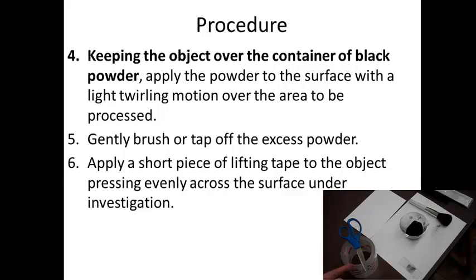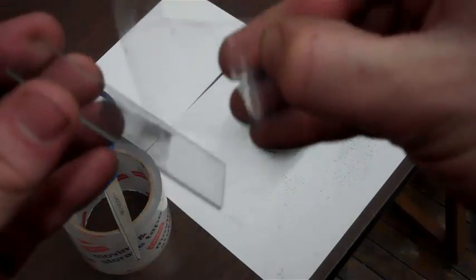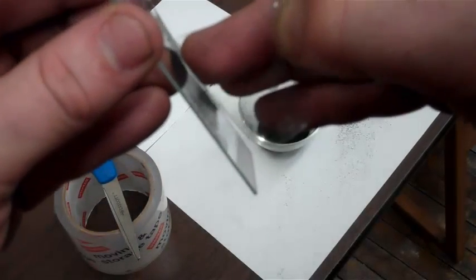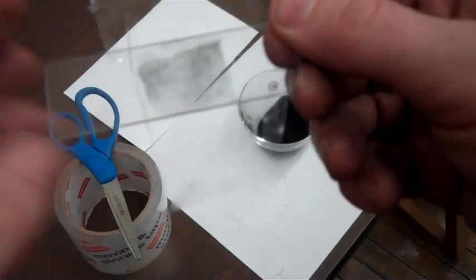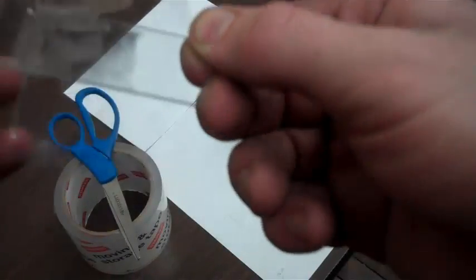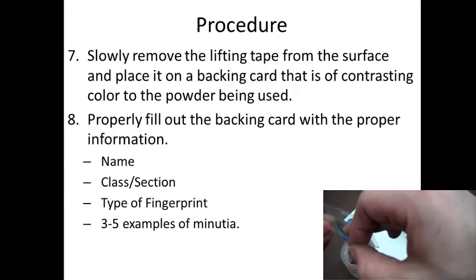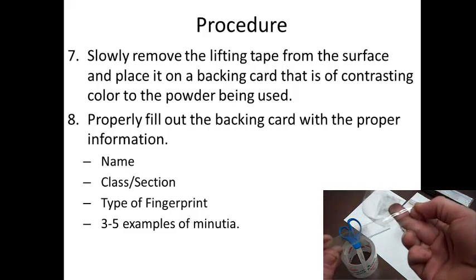Then you just take a little piece of lifting tape and apply it to the object, pressing evenly across the surface under investigation. Slowly remove the lifting tape from the surface and place it on the backing card that is of a contrasting color. So in this case, we're using black powder, so we're going to put it on a white index card.